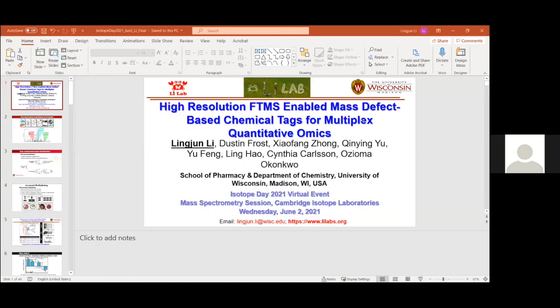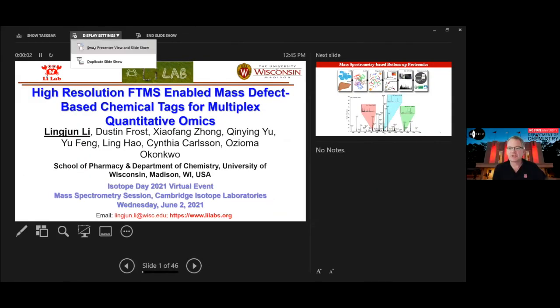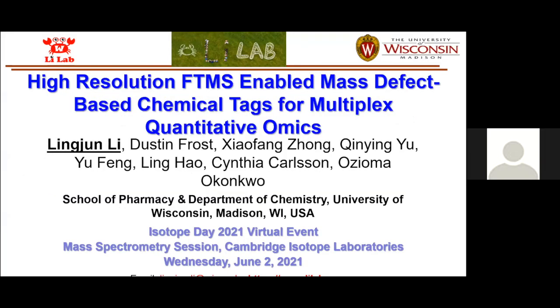I'm interested if you've applied the metabolomics CEMS method from the first part of your talk to search for BMAA and other metabolic markers of ALS in CSF samples. So your question was, have we done it in CSF? Have you done it in CSF?